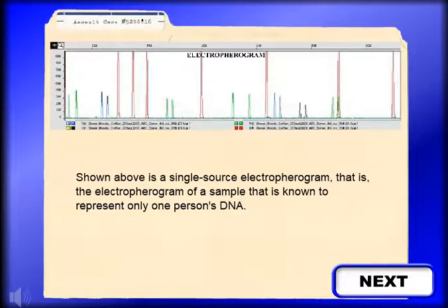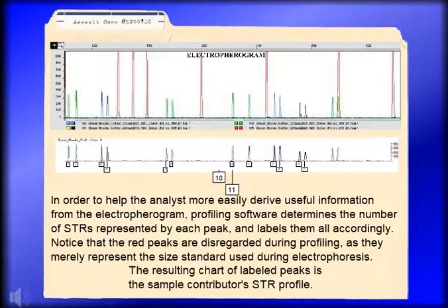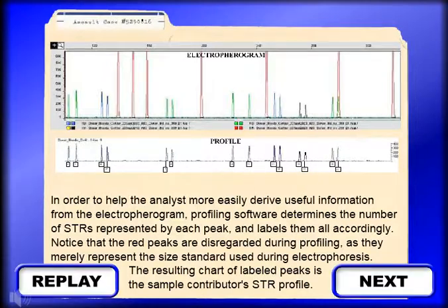Shown above is a single-source electropherogram — that is, the electropherogram of a sample known to represent only one person's DNA. In order to help the analyst more easily derive useful information from the electropherogram, profiling software determines the number of STRs represented by each peak and labels them all accordingly. Notice that the red peaks are disregarded during profiling, as they merely represent the size standard used during electrophoresis. The resulting chart of labeled peaks is the sample contributor's STR profile.